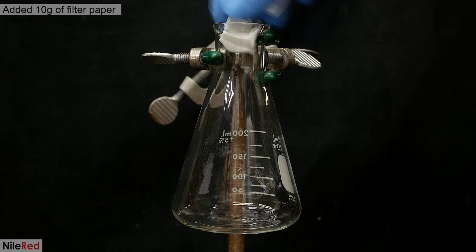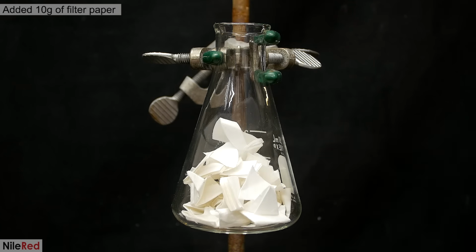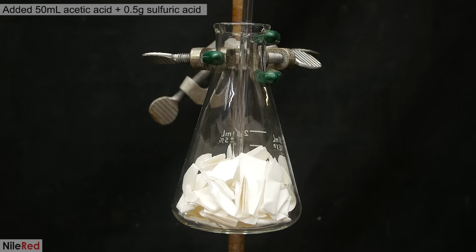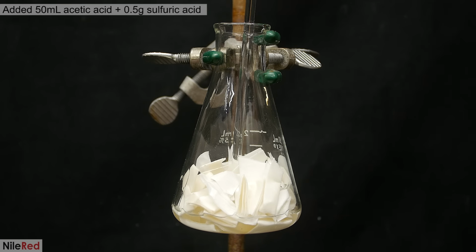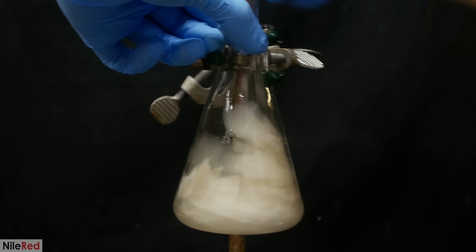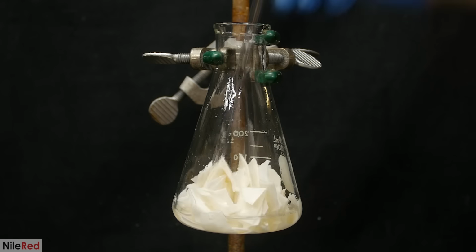To get things started, I cut up the filter papers, weigh out 10 grams, and add it all to a flask. I squish it all down with my glass rod, and I added a mixture of 50 ml of acetic acid and half a gram of sulfuric acid. I mix it around for a couple minutes just to make sure that I wet all of the paper. Then I let it sit for about an hour with occasional stirring.